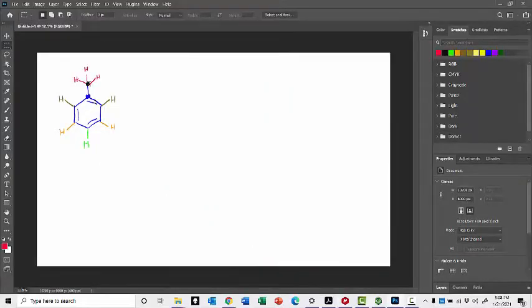So of course, keep in mind that the carbon that we're looking at in a carbon spectrum is this black carbon right here. And if we were doing our standard broadband decoupling, what we would see is a single line on the order of 22 parts per million, or wherever it is that it shows up in the spectrum. However, this particular carbon has 3 hydrogens attached to it. Therefore, it becomes a 1,3,3,1 quartet that is centered around the 22 parts per million chemical shift that it would have in the absence of any such coupling.